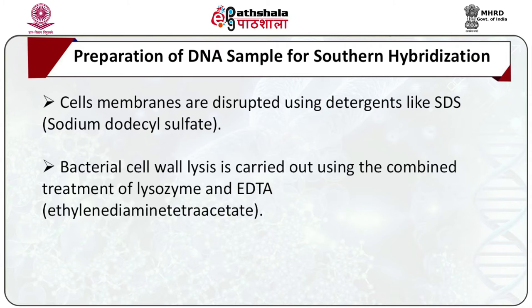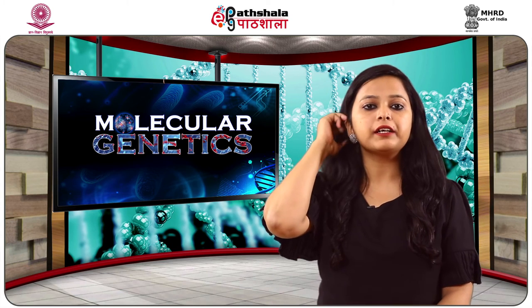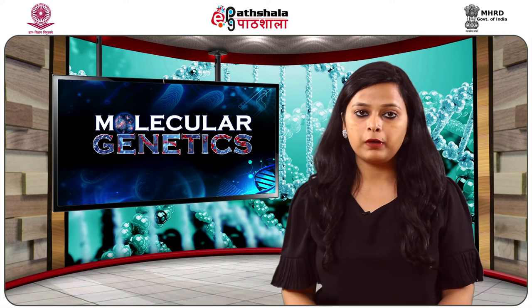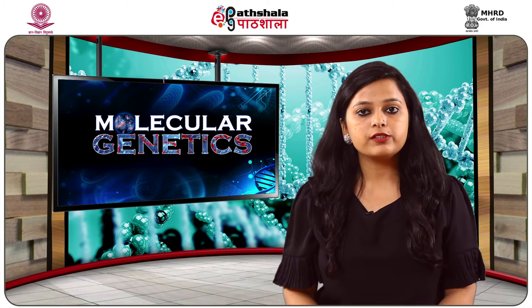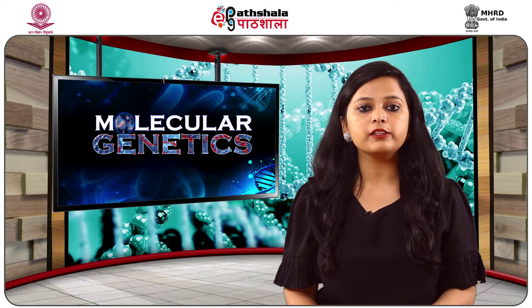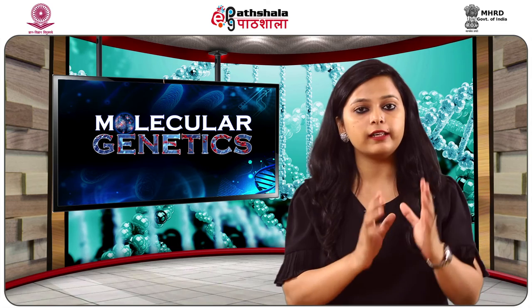Bacterial cell wall lysis is carried out using the combined treatment of lysozyme and EDTA, that is ethylenediaminetetraacetate. Lysozyme helps in the degradation of peptidoglycan compounds present in the cell wall, and EDTA, which is a chelating agent, chelates the magnesium ions that are involved in the integrity of the peptidoglycan structure of the cell wall.